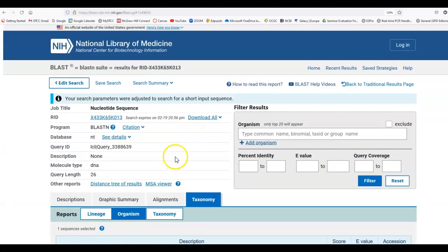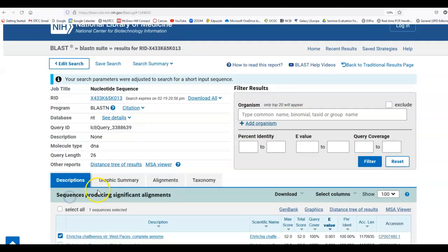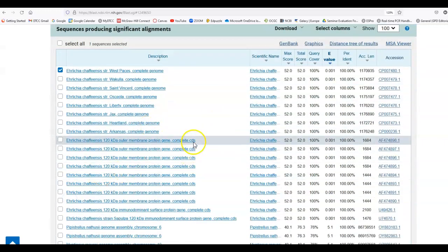So that's just a little bit of an introduction to the results that you would see when you do a BLAST-N.